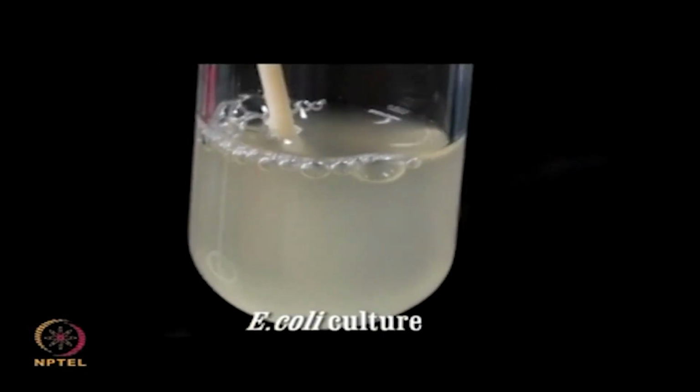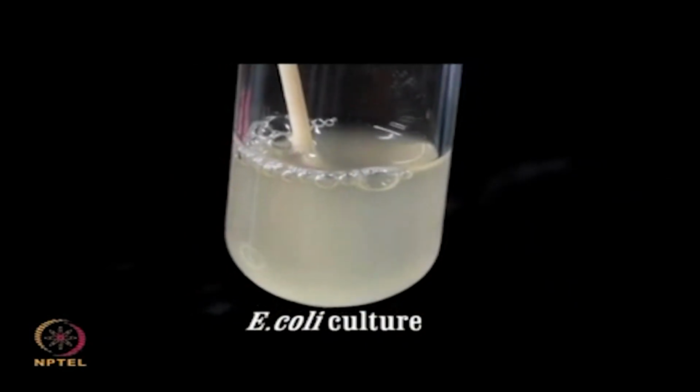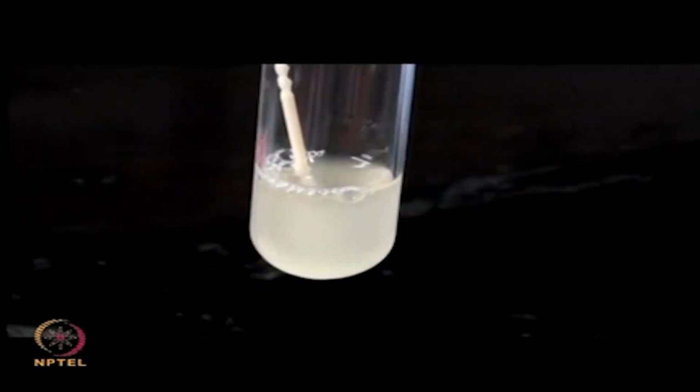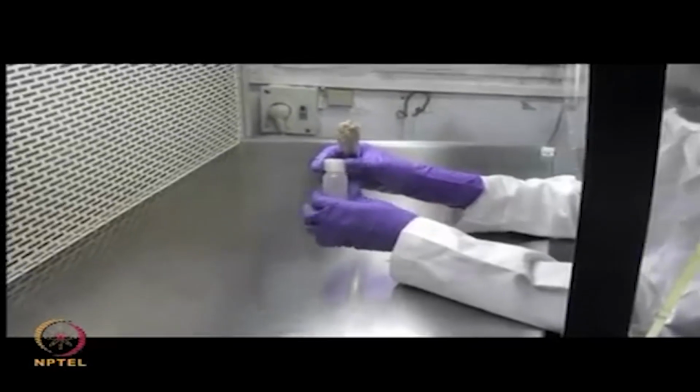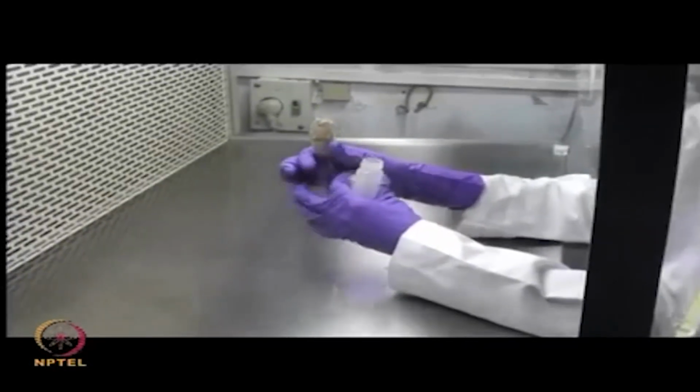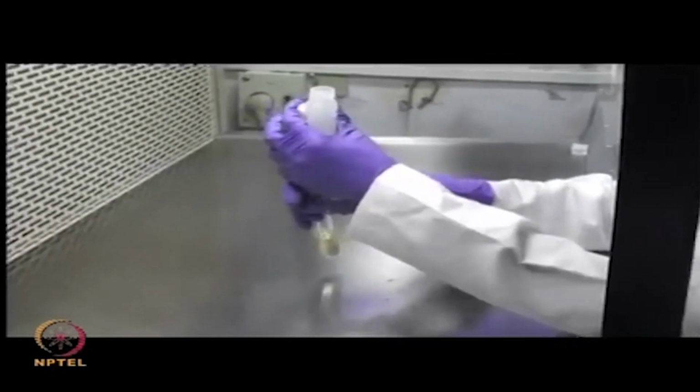The turbidity of the culture, which gradually increases, indicates bacterial growth. Culture harvesting. Transfer the grown bacterial culture to a fresh tube under sterile conditions.